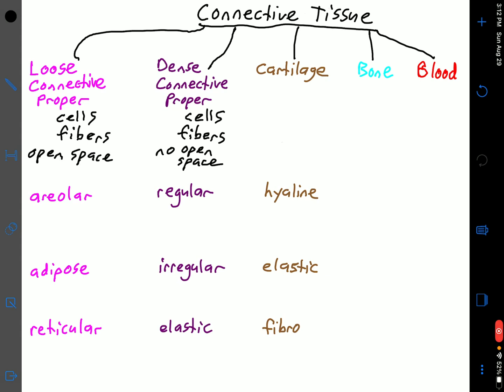What if you don't see much open space, or maybe it looks like open space, but you see things called lacunae? If you see large sacs that sort of look like bubble-like structures — a lacuna is this bubble-like sac with a cell in it — that will tell you that it is cartilage. Fibers may or may not be present, and that gives you cartilage.